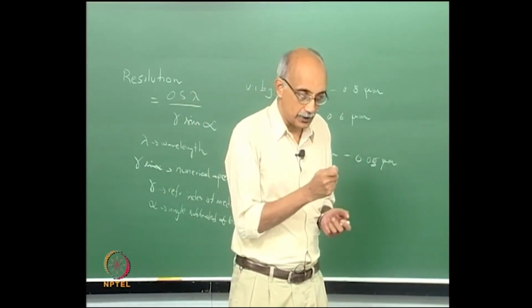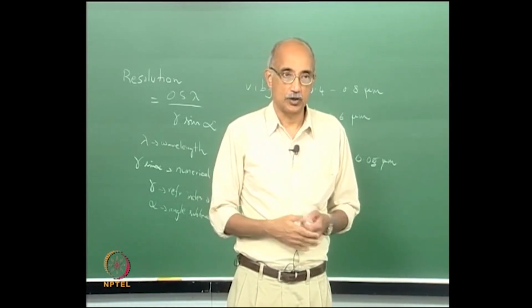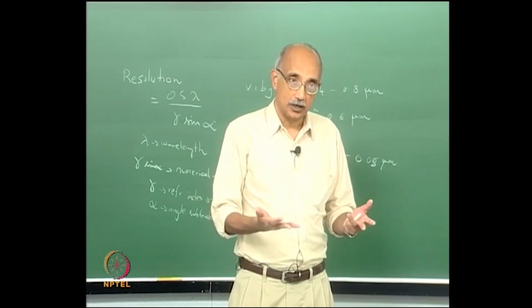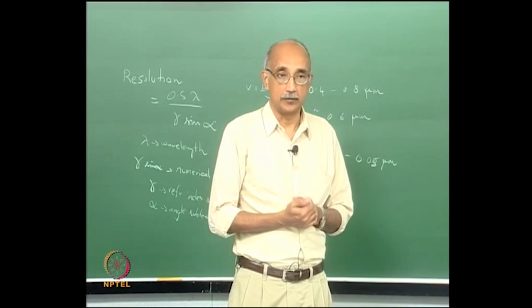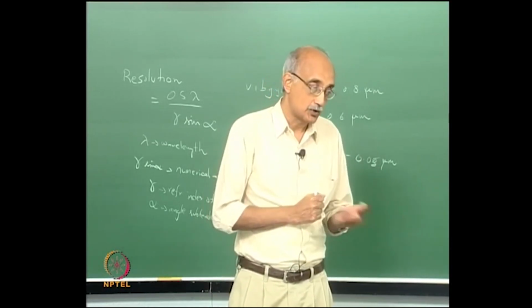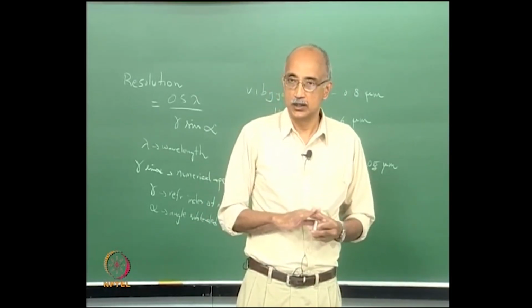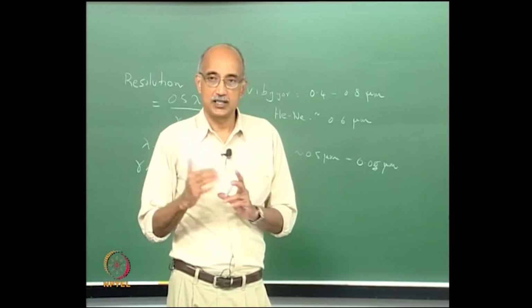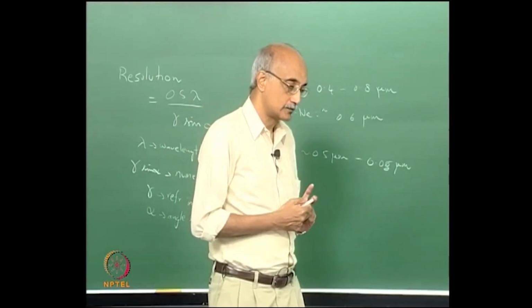If I use a magnifying glass, you can imagine that for me to go over this entire surface may take about an hour. If I start using an optical microscope, it's going to take me, I don't know, maybe a day to analyze this entire table. If I start using an electron microscope, for me to just analyze this surface can take up to a year, right. So, that gives you some idea about the scale of times that we are talking about.